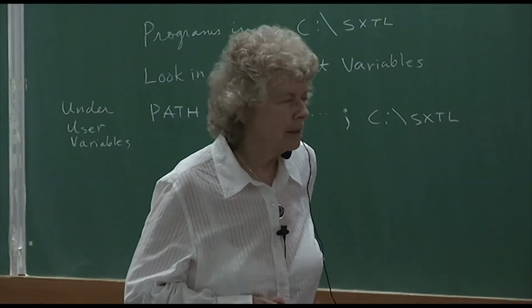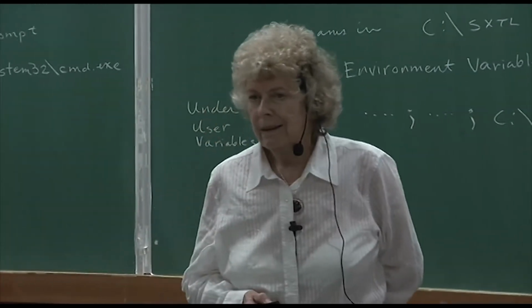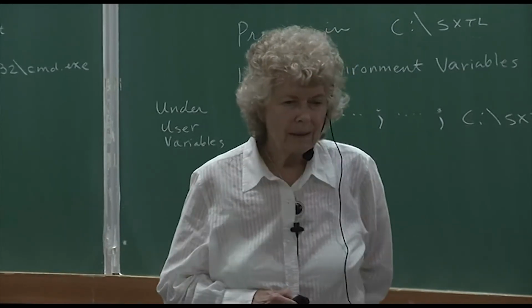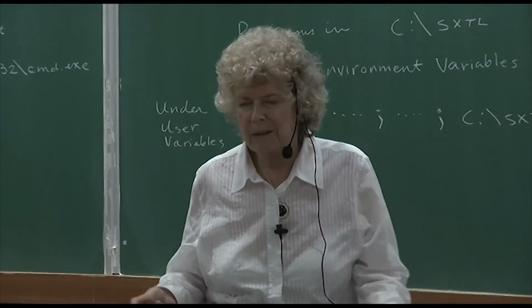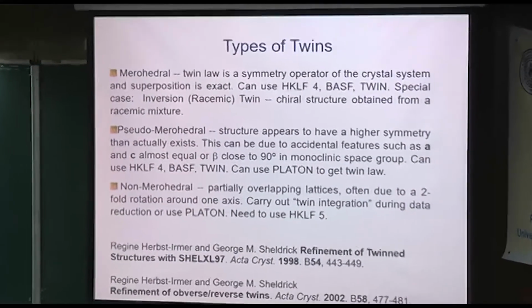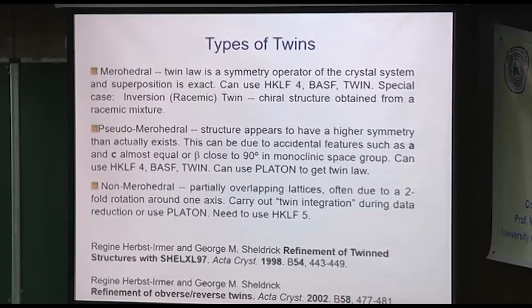Mostly you only see this in the very high symmetry space groups like hexagonal and cubic, and mostly you only see it in the cases of simple inorganic molecules that don't contain carbon and oxygen, but just metals. So that's rare for small molecule crystallographers, and if you do have that, good luck.